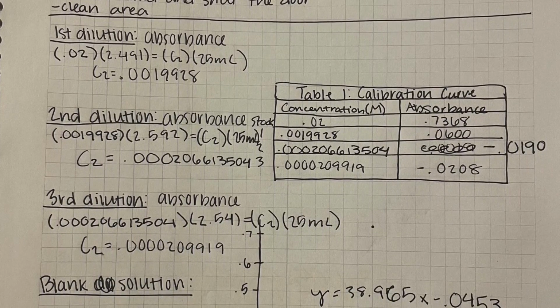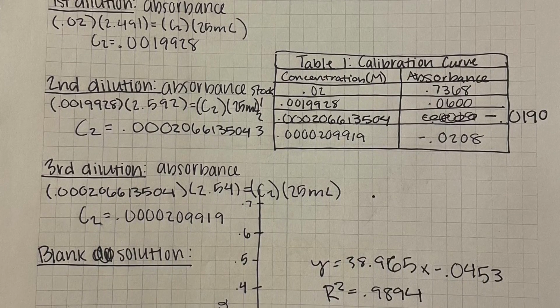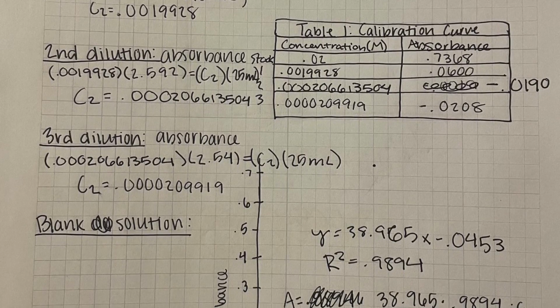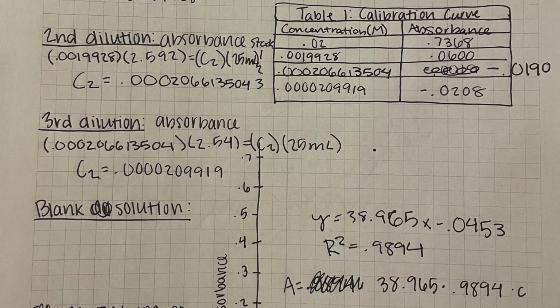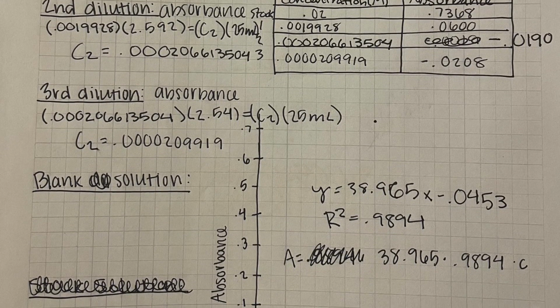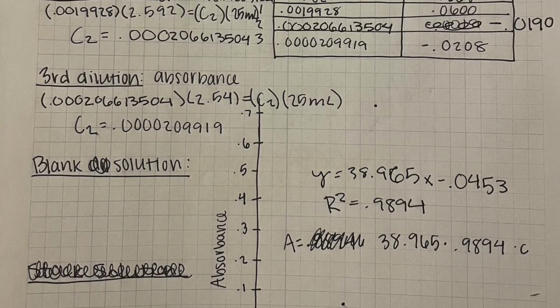The lambda max is the wavelength across the absorption spectrum where a substance has its strongest photon absorption. In order to find this wavelength, we must scan across all of them to find the right one. We also scan across all wavelengths to make sure that we do find the strongest one, because we could find one, but it may not be the best to collect data from.